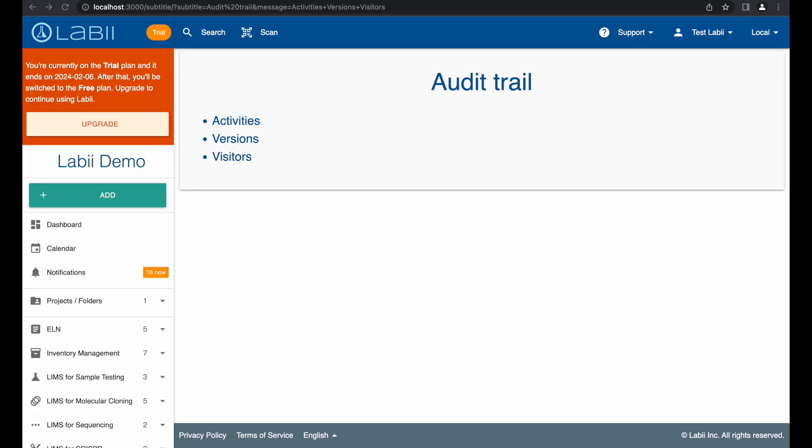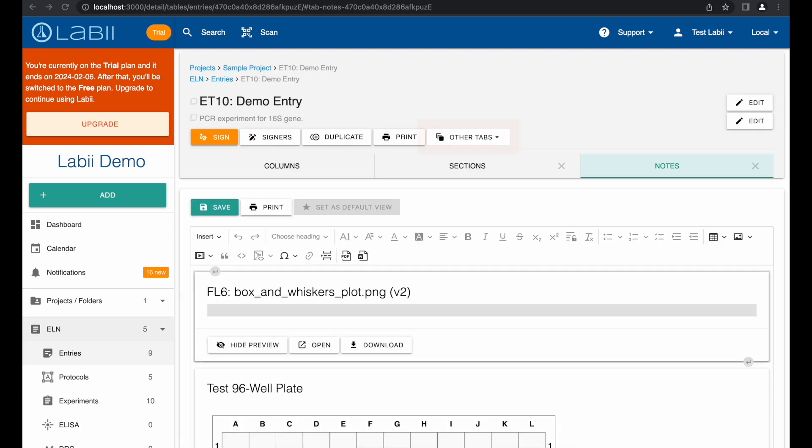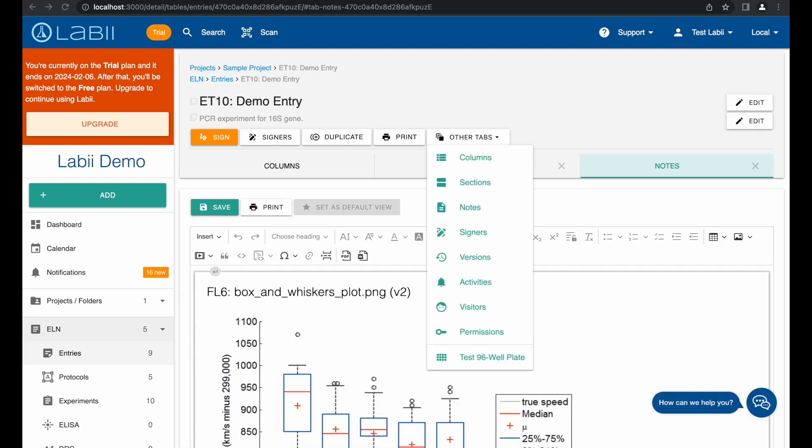The audit trail feature in Labii ELN allows for the tracking and recording of all changes made to an experiment, including who made the changes and when. This feature provides a clear and complete history of an experiment, ensuring that all data is secure and tamper-proof, and easier to identify any potential problems or issues. Click button of other tabs. Select Version to view a list of all versions, Activities to check a record of activities, and Visitors to list down visitors.